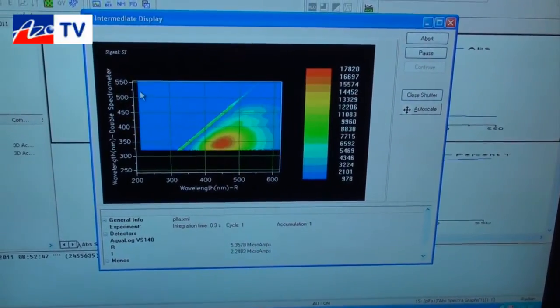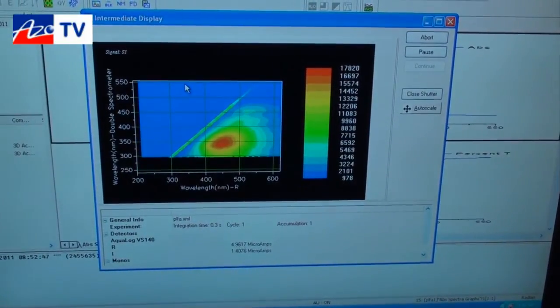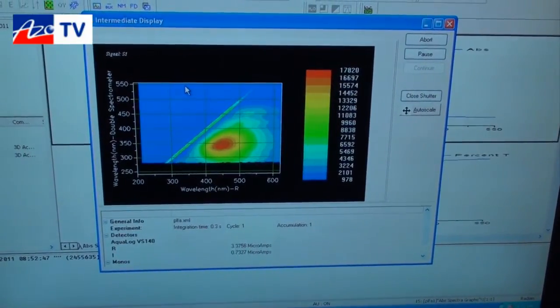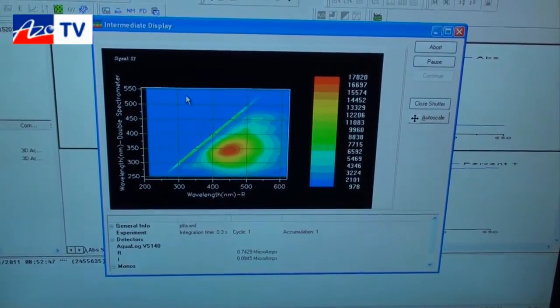Just one thing to point out is that previously with other scanning instruments this particular measurement takes 20 to 30 minutes and up to two hours in some cases where samples are very dilute. Here we're able to do it in just a few seconds.